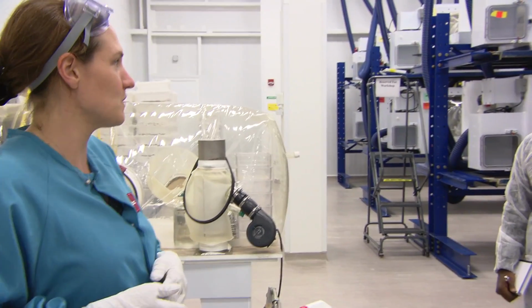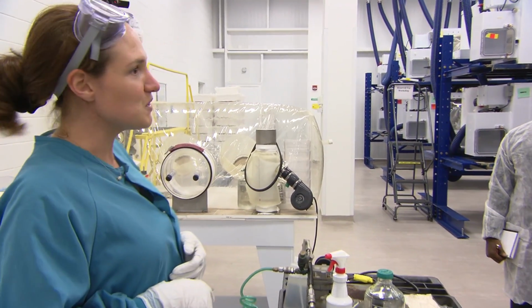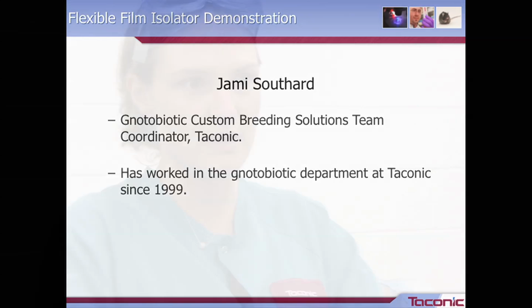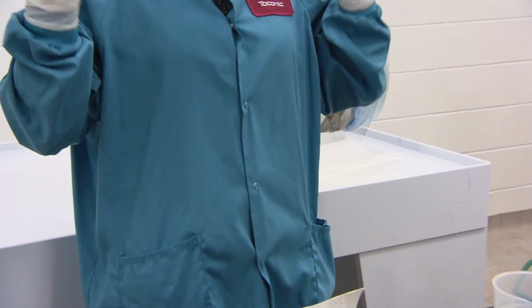And today I'm going to demonstrate the entry of supplies, the entry of animals, and our procedures for microbiological monitoring. So first I'll get started with personal protective equipment. We always want to make sure that we have on a smock of some sort with our arms covered, chemical resistant gloves, and splash goggles.